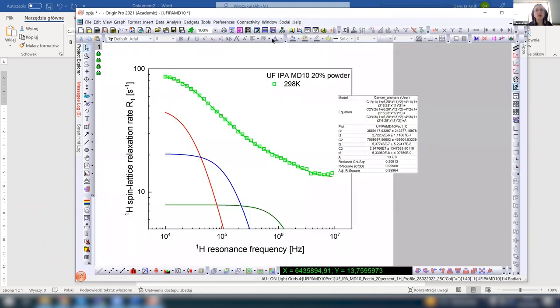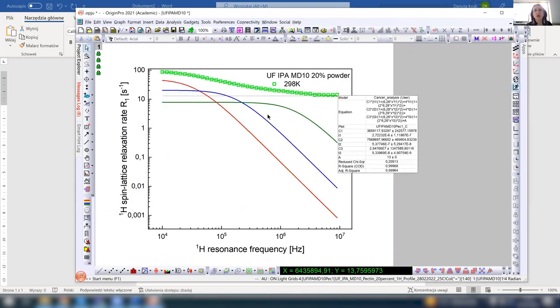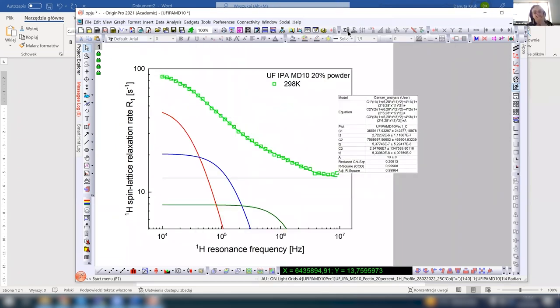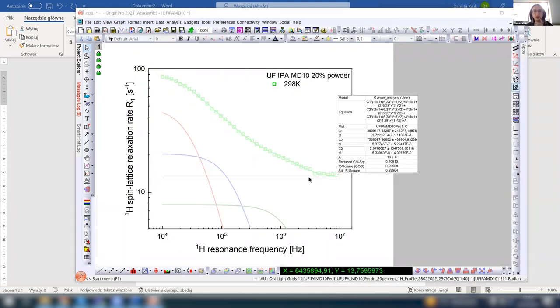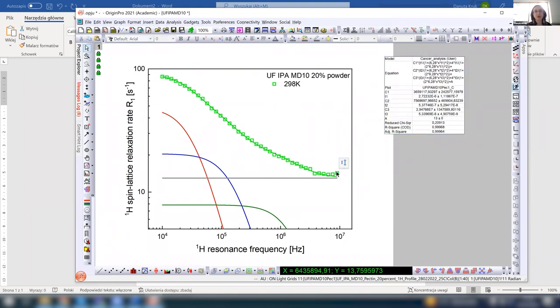And this one is, yeah, window, yeah, insert, log to layer line. Apply, close, the same well-known thing. Let me change it. Yeah, so here you have this frequency independent term. It is absolutely sure, looking at this, that this contribution is of no importance, yeah? This one. Okay.